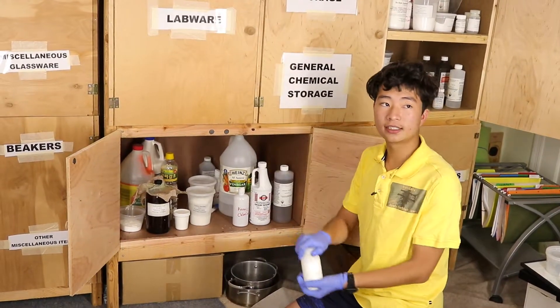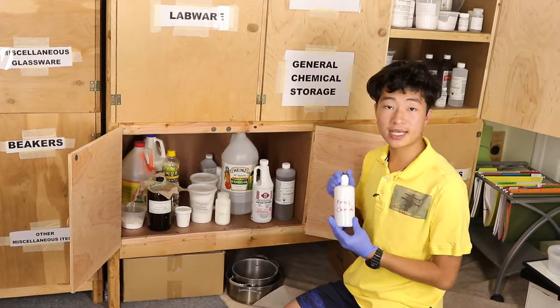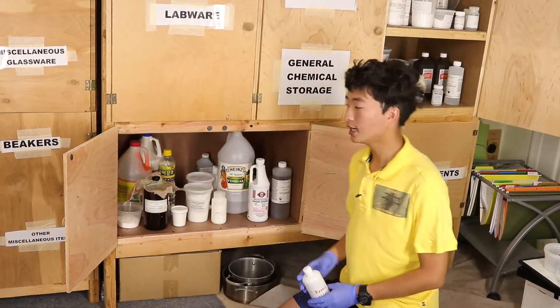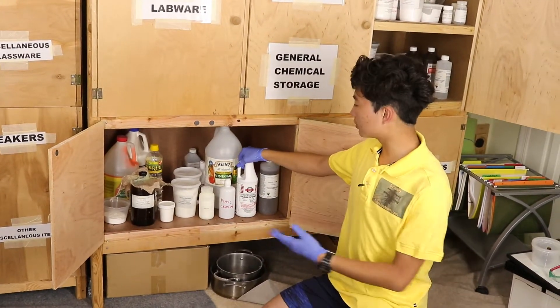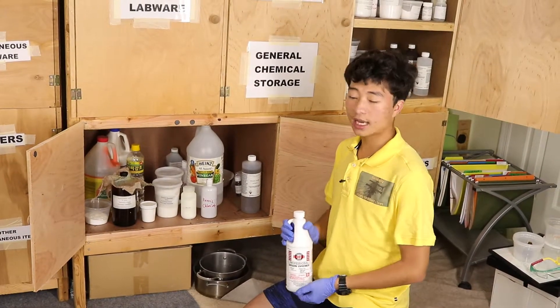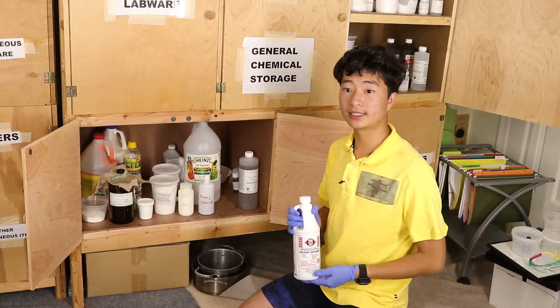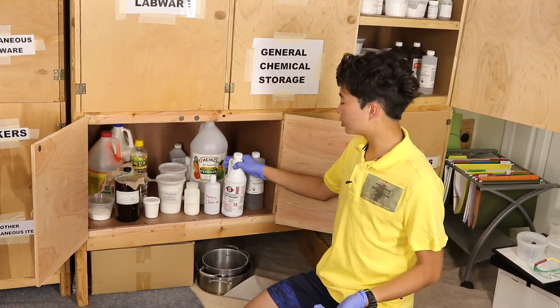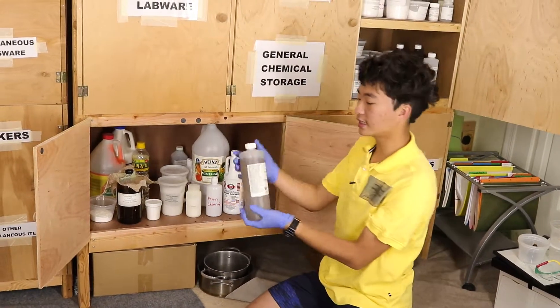I have boric acid from roach killer — really useful stuff. Ferric chloride, which is PCB etchant — I made this myself using steel wool, hydrogen peroxide, and hydrochloric acid. I've used this quite a few times making my own PCBs. At my local hardware store — not Home Depot — they have sulfuric acid drain opener. In my opinion it works better than any alkaline drain opener, though it's incredibly aggressive and dangerous. I use it both as a drain opener and to extract impure sulfuric acid.